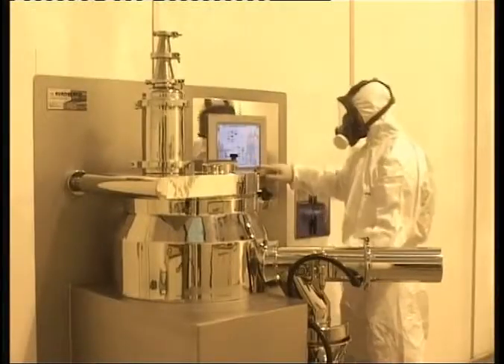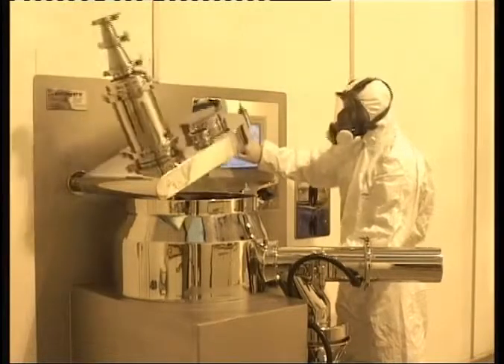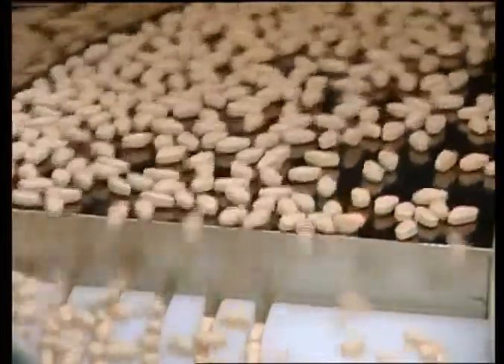The process of wet granulation is widely used in the production of solid dosage formulations in the pharmaceutical industry. Because of the diverse nature of pharmaceutical materials, granulation is often employed as an intermediate process to enhance flow and compaction properties and improve the final product performance.